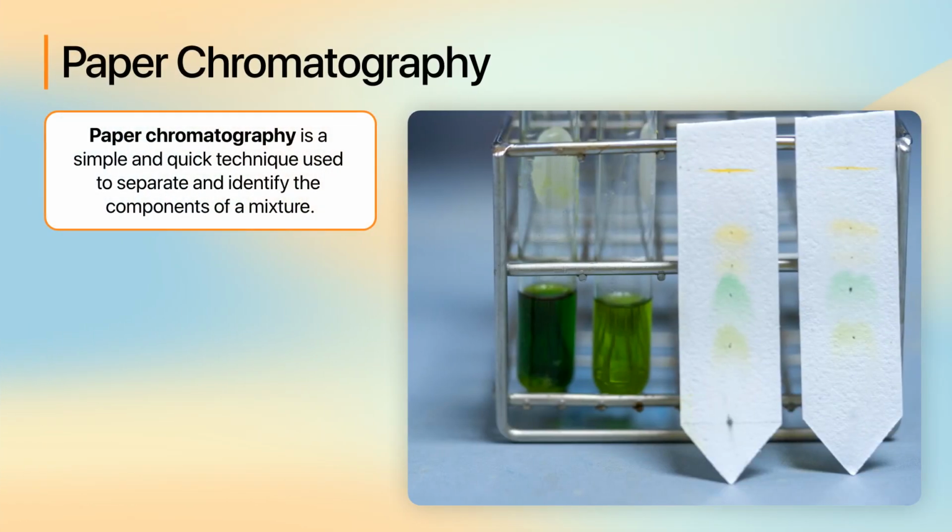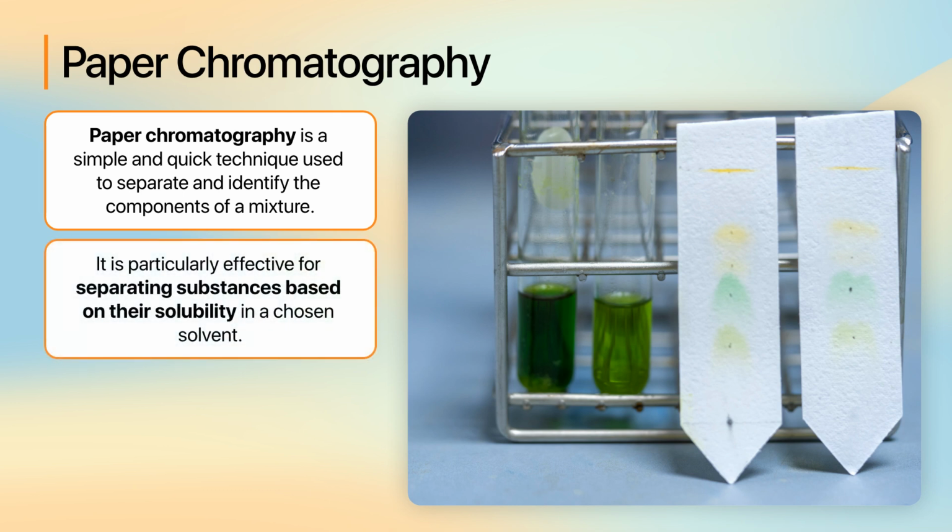Paper chromatography is a simple and quick technique used to separate and identify the components of a mixture. It is particularly effective for separating substances based on their solubility in a chosen solvent.